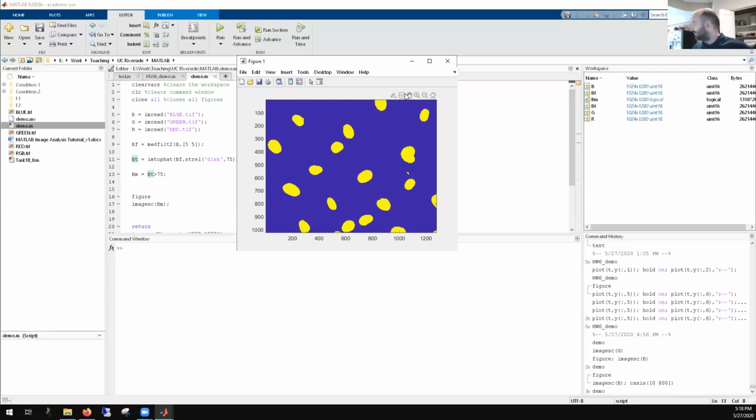So here we have blue or yellow. And again, these are just the colors MATLAB is choosing to render with. They don't have meaning beyond that. But the blue is 0 and yellow is 1. So basically we've gone from this complex grayscale image to a really straightforward, we're either working with something that is nucleus or is not nucleus. Is nucleus, is nucleus, is not nucleus. This nucleus might be dimmer than this nucleus, but at this point it doesn't matter. It's either true or false. This is a logical expression.